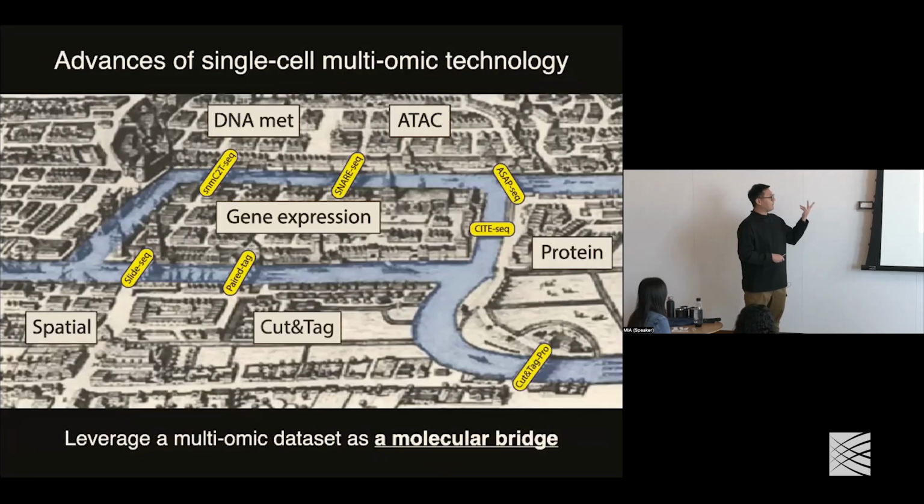And then we know, right, we have those single cell multiomic technologies that allow us to measure multiple modalities simultaneously at the single cell level. Those kinds of measurements are just like a biological translator. When we know one modality, we can check the cells, and we know what the other modality looks like. And this provides an opportunity to say, okay, if we can use something to connect those unpaired modalities. So here we propose our method called bridge integration that leverages this multiomic data set as a molecular bridge to connect those two single modality data sets.